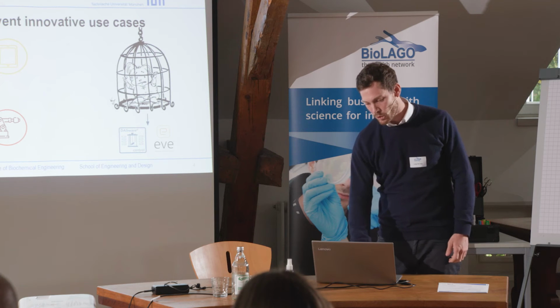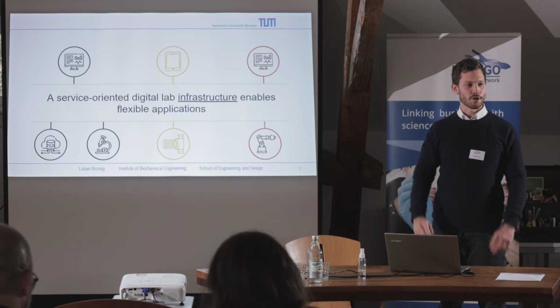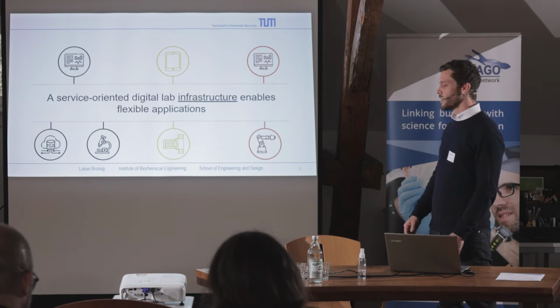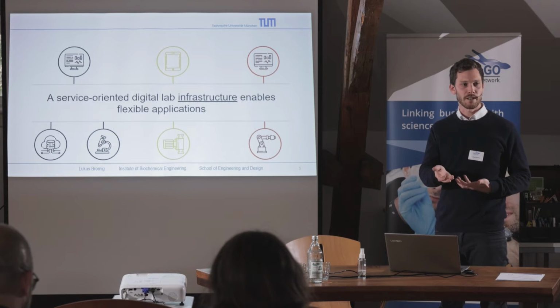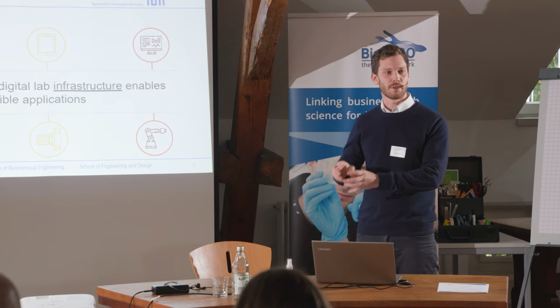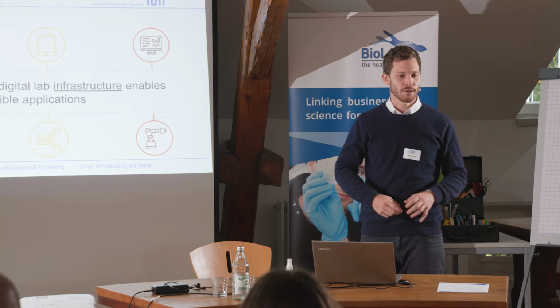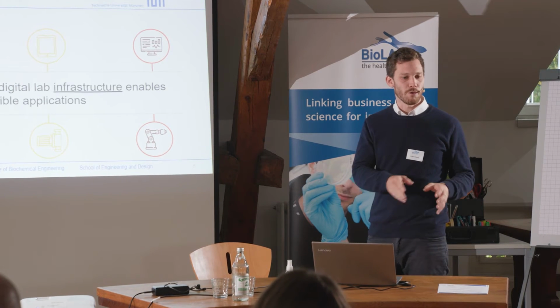And that's why we turned to SiLA to basically create this service infrastructure, this service layer. So the idea behind SiLA is that all these devices become a service in your lab that you can just access. So you don't have to go through a specific desktop app. You don't have to run around your lab or go from the office downstairs to do something at a specific computer that is set up there for that device.